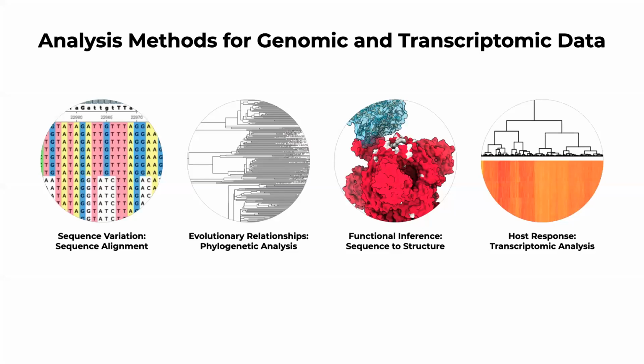So we'll talk about analysis methods and tools for genomic and transcriptomic data analysis of host pathogen interaction. For example, methods to study relationships based on local and global multiple sequence alignment, what's called MSA. Phylogenetic analysis and evolutionary studies used for genome ancestry and population fitness. Chemical and structural implications of sequence variation mapped on PDB models, or models of proteins that we know of. And host pathogen interaction and treatment response based on transcriptomic data.